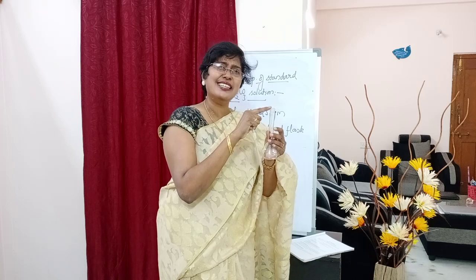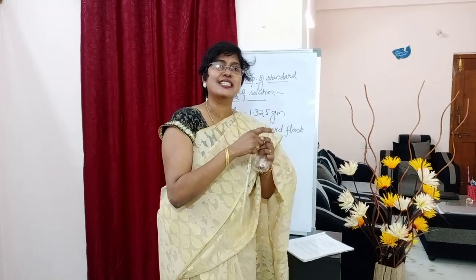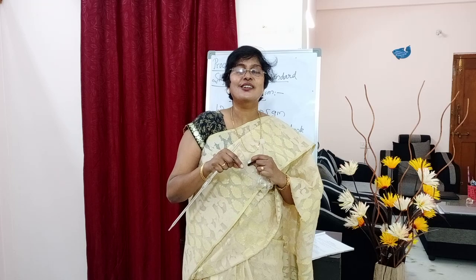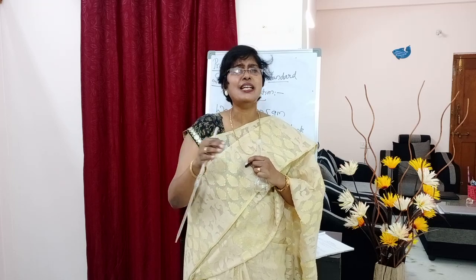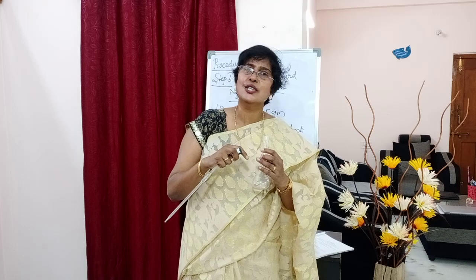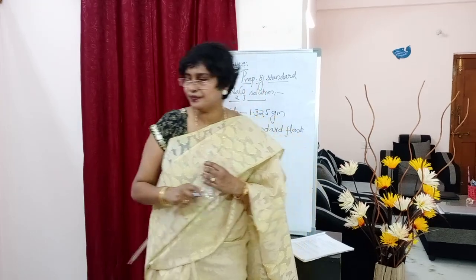When you have added water till the mark, you should close this volumetric flask. In case by mistake the lower meniscus is a little above the mark, don't try to discard the solution. Let it be. Next experiment, you will do it carefully. In the beginning it will be a little difficult. Later you will get used to the experiments. Okay, students, that is your first step.